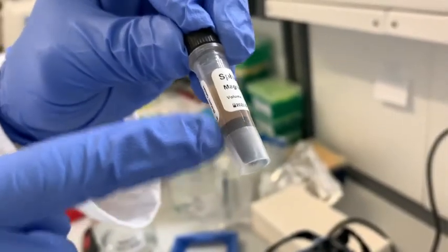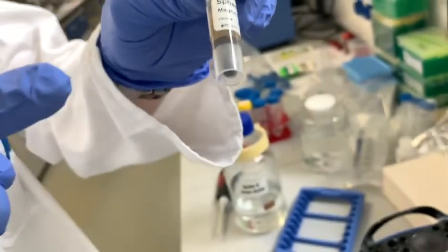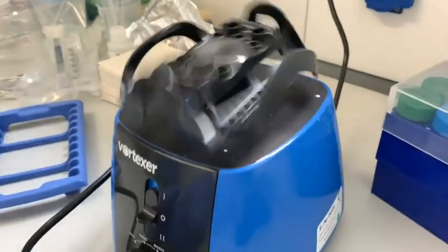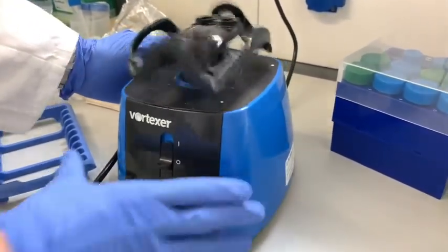Before using the magnetic beads, as you can observe here, the magnetic beads are sedimented below. To avoid that, it is important to place the magnetic beads in a vortex before use. Please pay attention to this step.